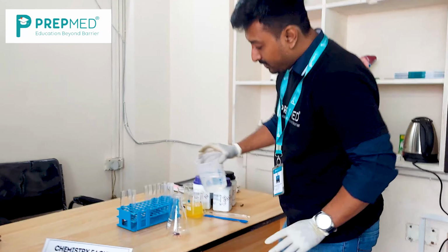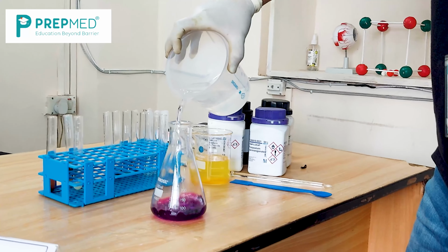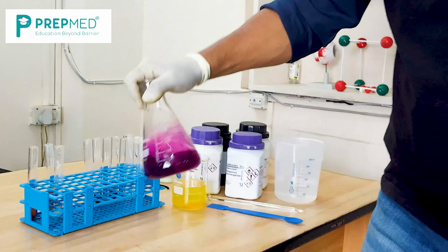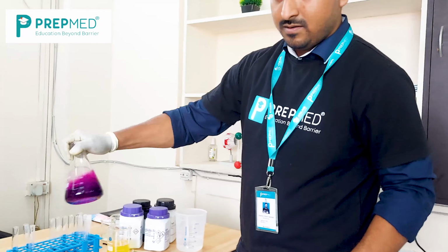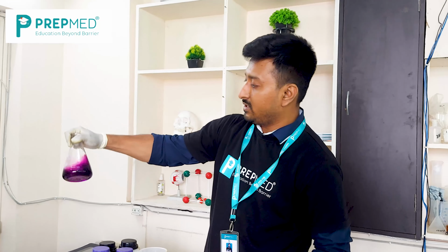Now we will add water. Now you can see the color of the solution is purple.